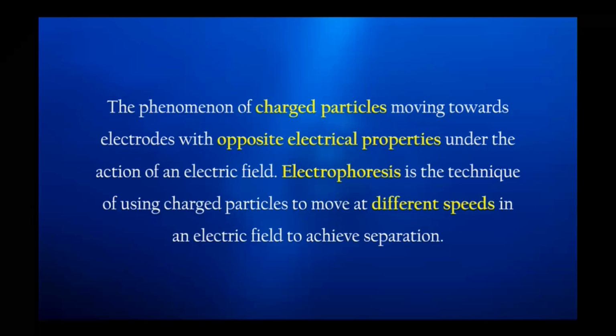The phenomenon of charged particles moving towards electrodes with opposite electrical properties under the action of an electric field. Electrophoresis is the technique of using charged particles to move at different speeds in an electric field to achieve separation.